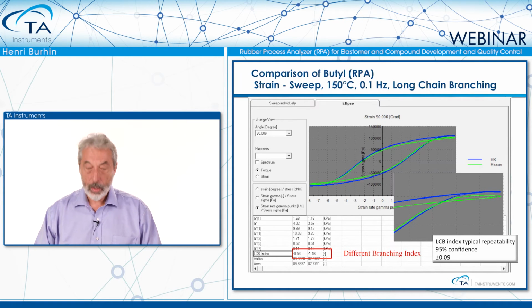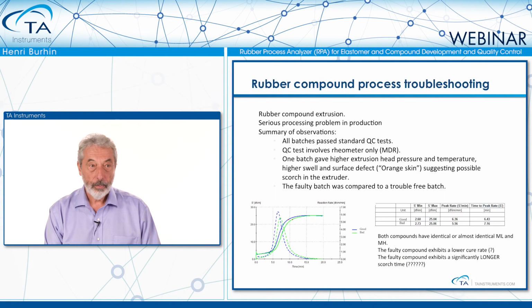It is also interesting to know that between the two polymers there is a very, very distinct way they pick up oil in mixing.